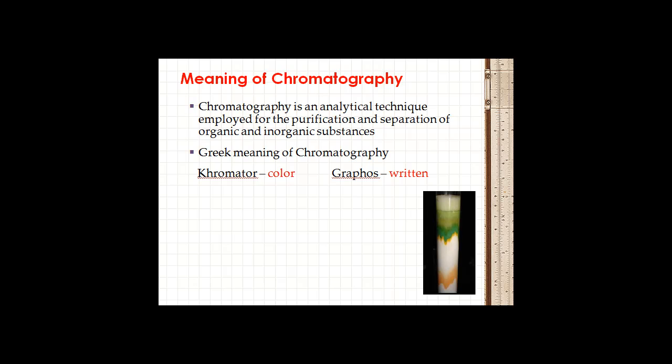Chromatography is a Greek word. Chromato means color, grapho means write. Chromatography is an analytical technique employed for the purification and separation of organic and inorganic substances.